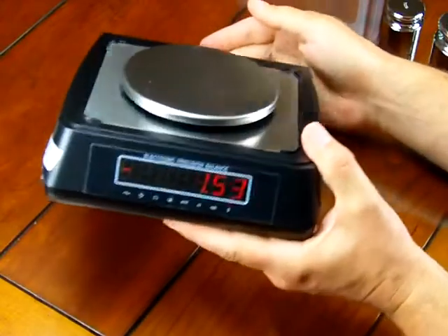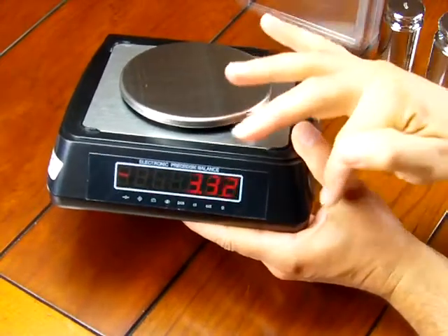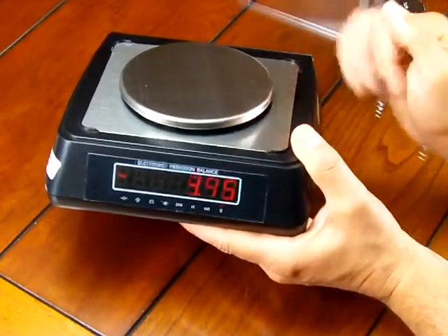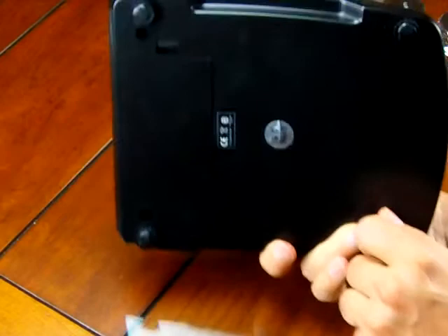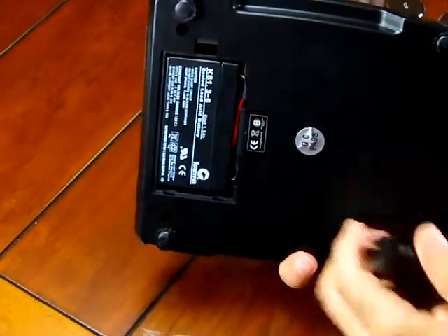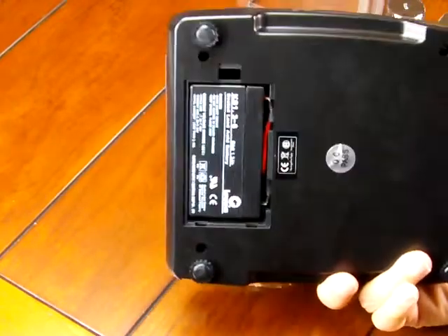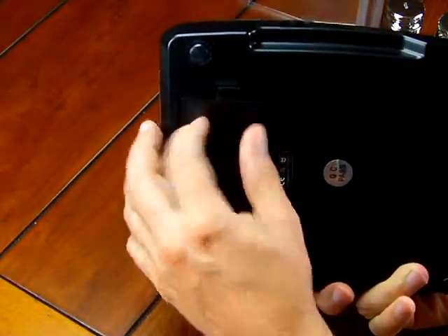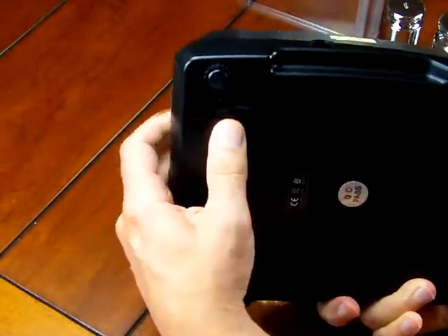The rear of the scale has a display in the back. So if you're running a demonstration, the public or students could see what weight you're seeing on the front display — there's one on the rear too. That's another nice unique feature for this price range. On the bottom of the scale, we have four adjustable feet. Another unique feature: this scale comes with a lead acid rechargeable battery. Right now the scale is operating off of batteries, which gives you a lot longer battery time and makes it more affordable — you're not looking for alkaline batteries.